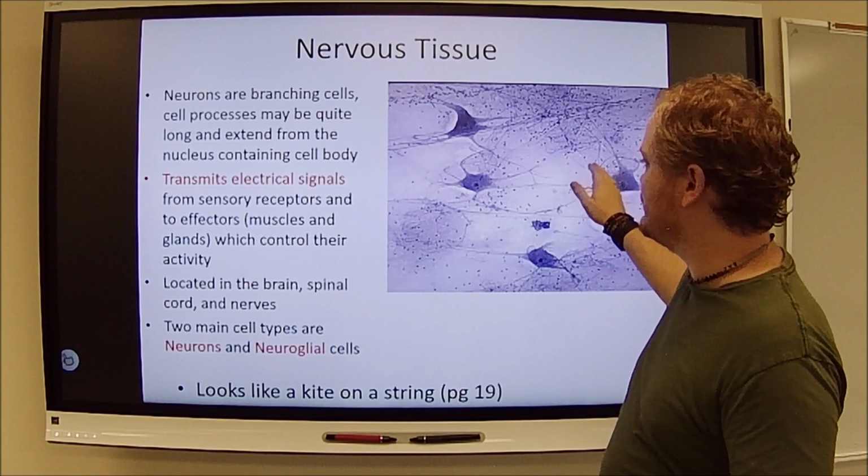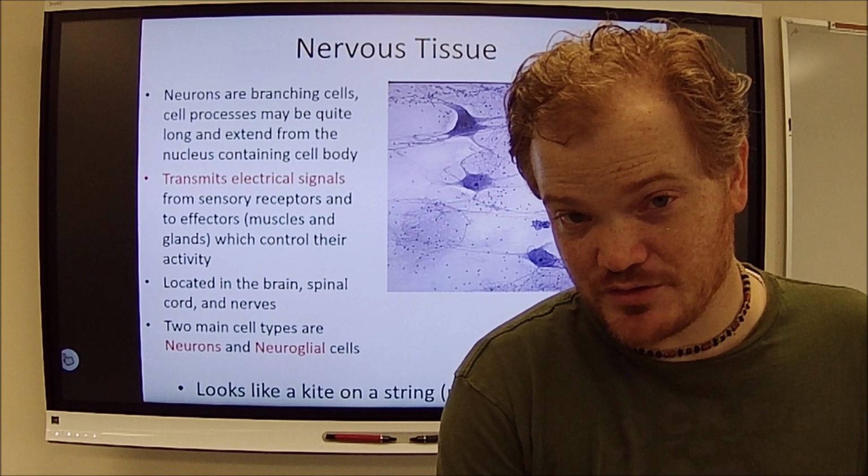So now, what I'm going to do is we're going to go through and look at each individual slide, and we're going to talk about how to use a microscope effectively.